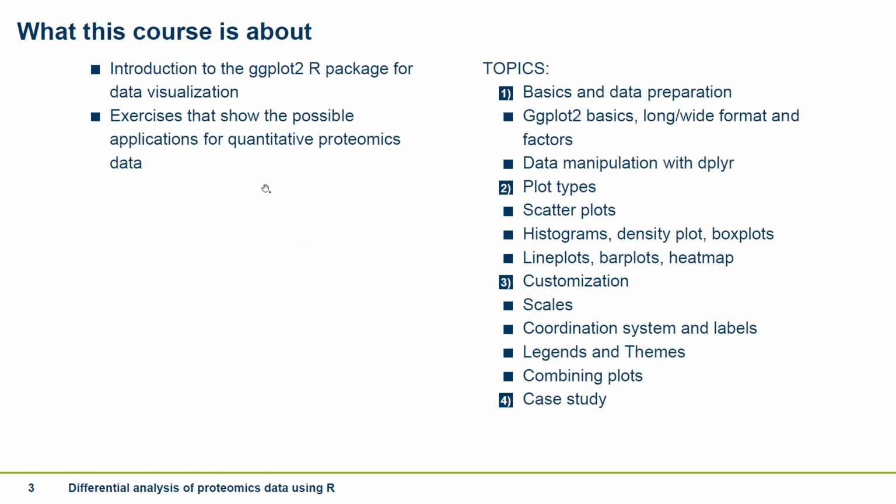In this course, we will give an introduction to the ggplot2 R package for data visualization, and then in the exercises we will show possible applications for quantitative proteomics data. So here on the right, we can see the topics that we will cover today. We start with some basics and data preparation.